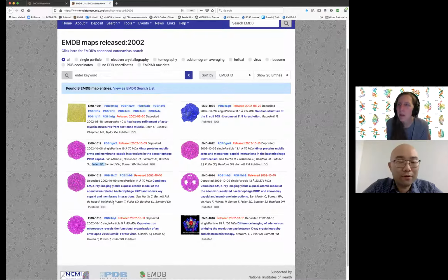I think that's an interesting point where a lot of people think of EM now, especially in the lens of cryo EM, but a lot of EM was tomography, and that was a good chunk of what electron microscopy was for people. And then later on, 2D electron crystallography is when we started pushing the resolution. And then what people think of as single particle is just relatively recent. The technique's been around for a while, but the application of what we think of as cryo EM now is really only a few years old.